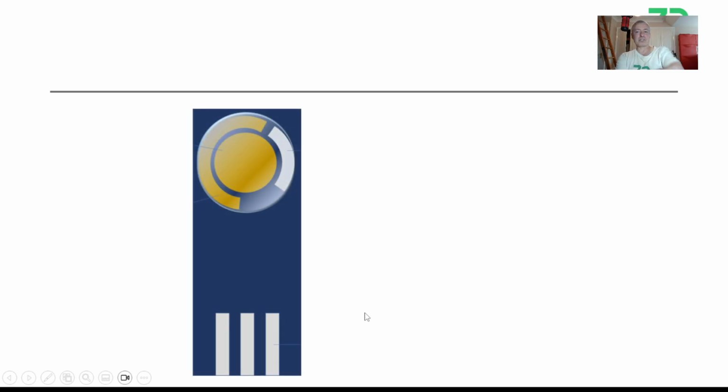This is the image I got off Wiki, by the way, so I have to immediately say this came off Wikipedia. I think this image is actually a bit of a problem because it encourages people to design screen printed electrodes that look like this.